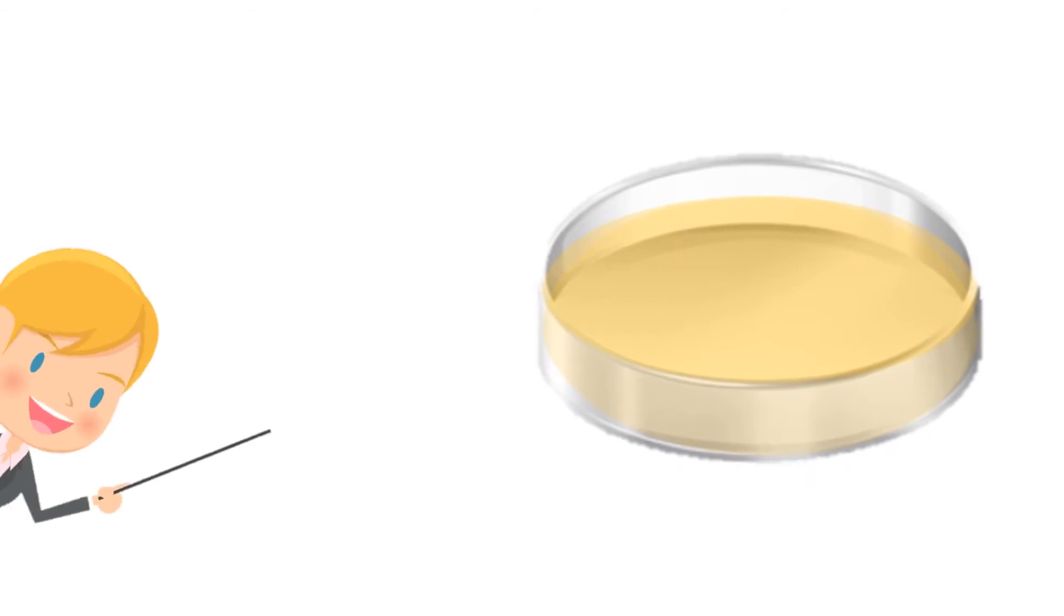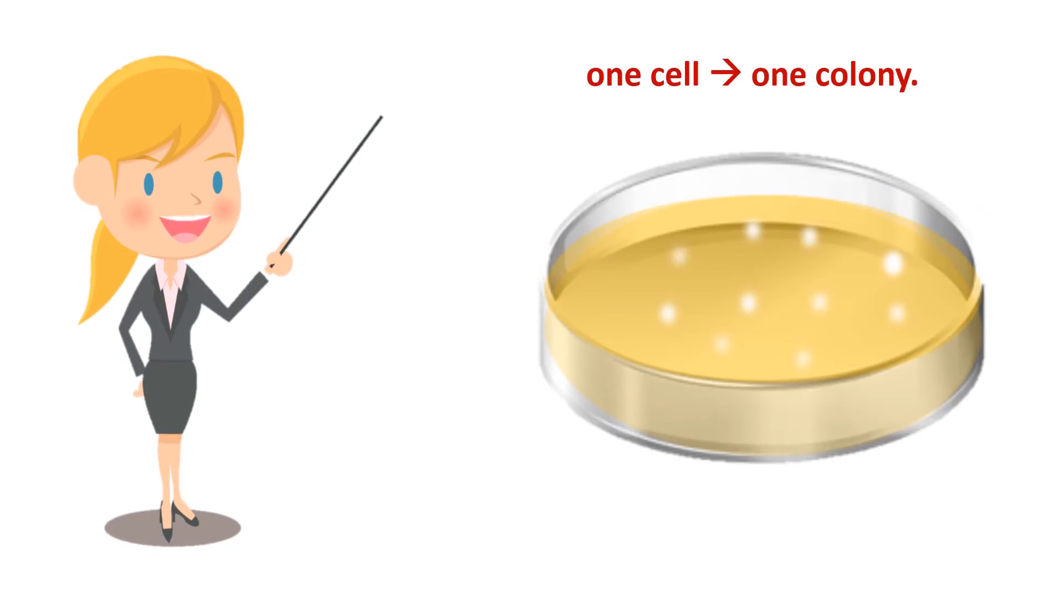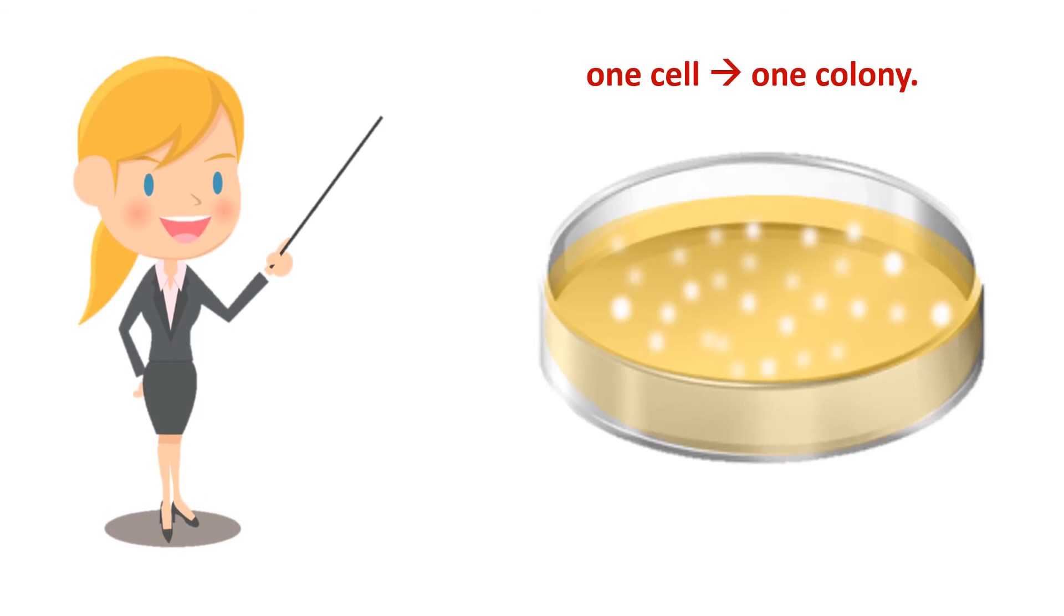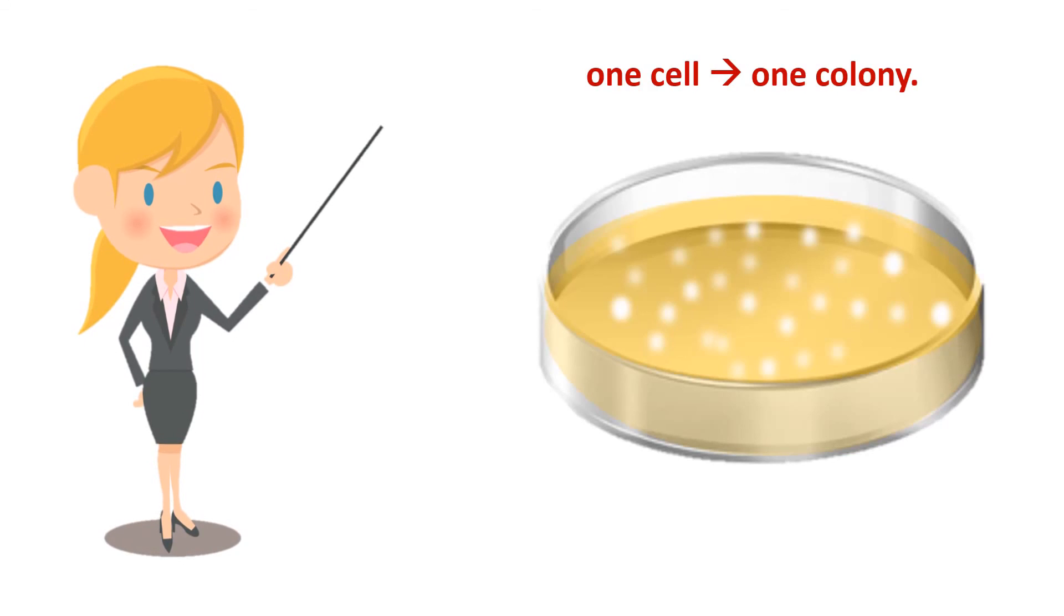Microbial growth using an agar plate will yield individual colonies of cells that, hopefully, have been derived from one single parent cell.